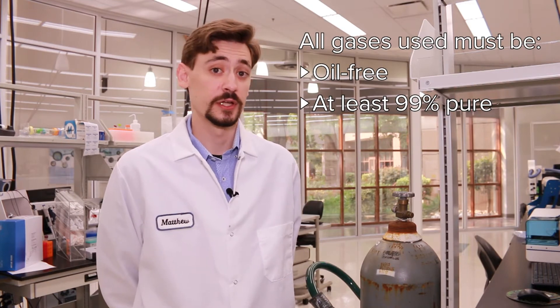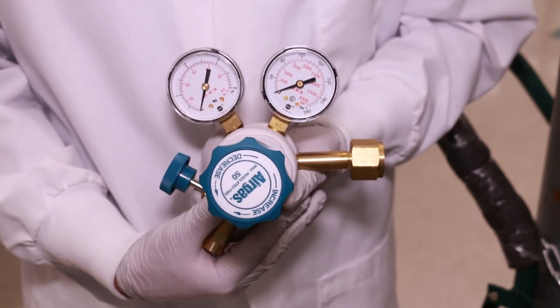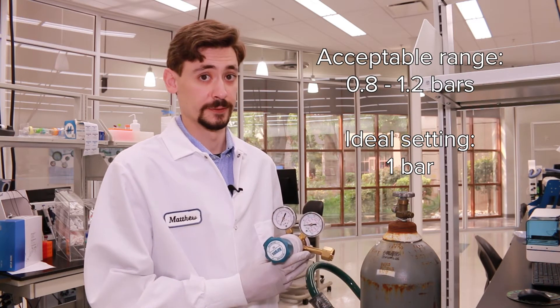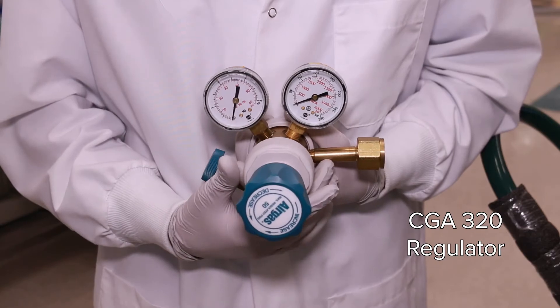The next portion of this video covers the steps necessary for connecting the gas cylinders to the instrument. All of the gases used in your system must be oil-free and at least 99% pure. Prior to setting up your gas cylinders, you need to ensure that you have the appropriate regulator. The one shown here is a two-stage regulator that can step down the pressure to the instrument at one bar — you want a range of 0.8 to 1.2 bars, but one bar is the ideal setting. The pressurized CO2 cylinder requires a CGA 320 regulator with a 13/16th of an inch fitting.